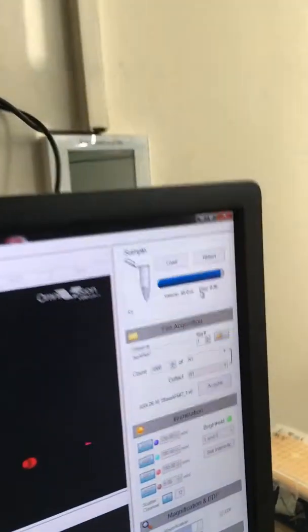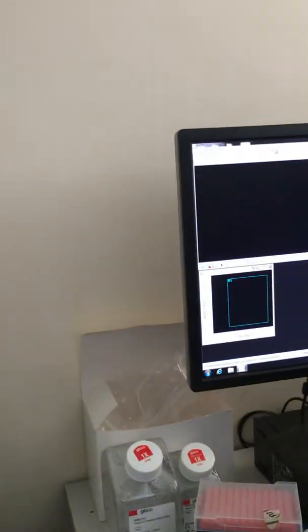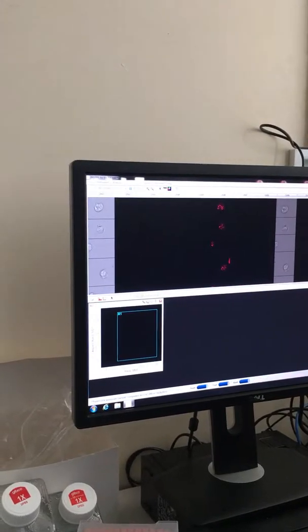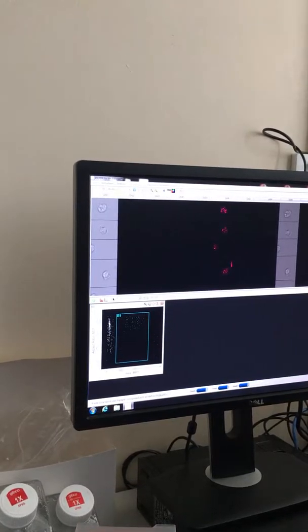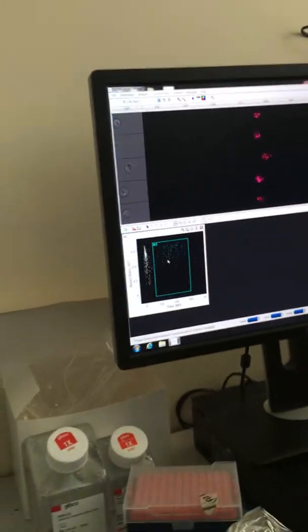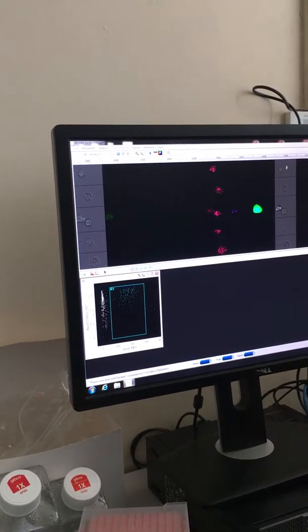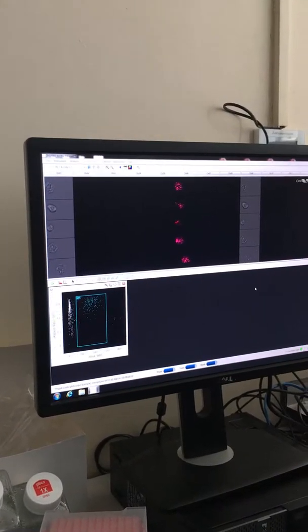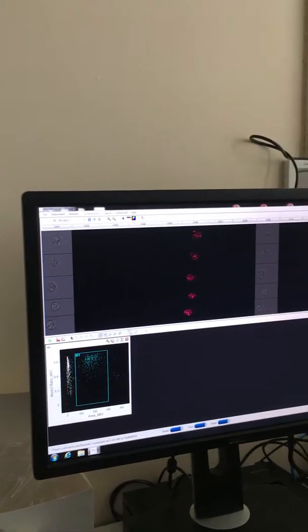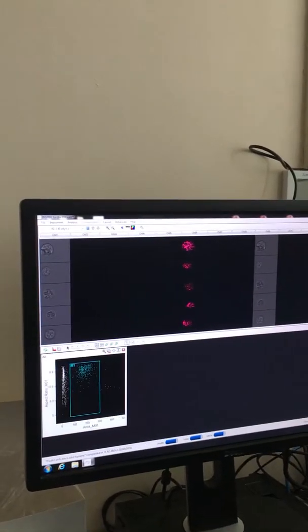See at the top? Okay, that's good. Okie dokie, there are your cells. So now your cells are appearing in the box. Do you need to adjust? They seem to be centered properly, so that's fine. No, now they're not. You've let it stabilise, but it's stabilised slightly to the left. So you want to centre, press it maybe twice, and one more time. Yeah, about 7.9, and then let it run.